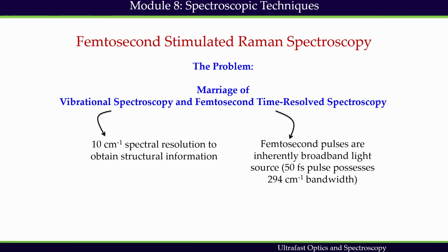Hence, to understand the mechanisms and dynamics of the evolution of structure of reactant into product, we can propose to use vibrational spectroscopic techniques with femtosecond time resolution to follow the temporal evolution of vibrational modes which are responsible for the structural change. For example, in its simplest form, one can monitor temporal evolution of a stretching mode to follow bond breaking or bond formation in a reaction.